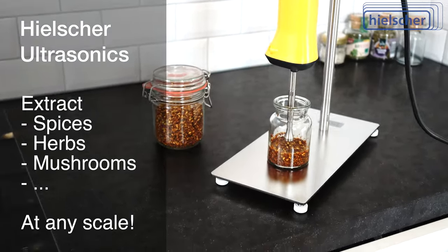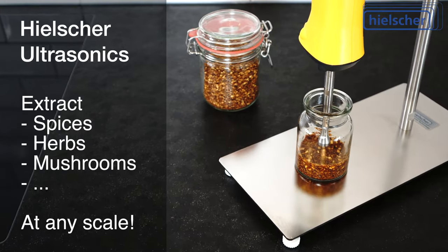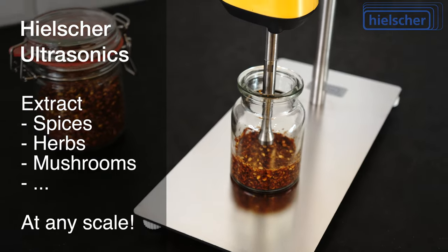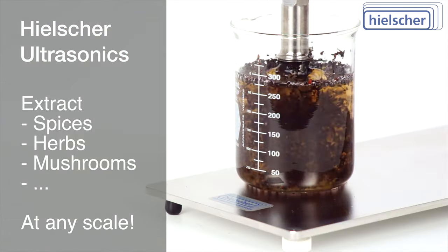Do you want to produce your own spice extracts or sauces? Whether for the restaurant kitchen, the ambitious sous chef, or for commercial manufacturers, with Hielscher ultrasonic equipment, you can produce high-quality extracts and sauces in a short time.